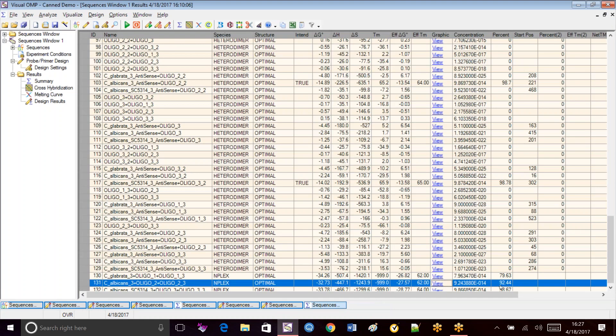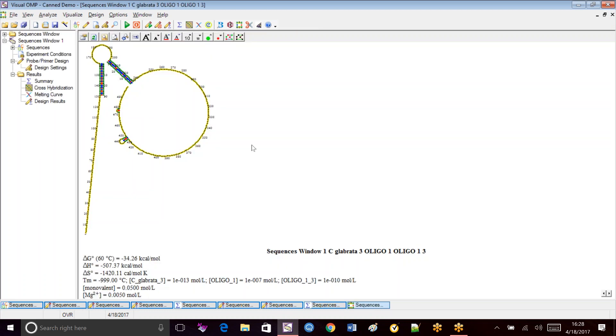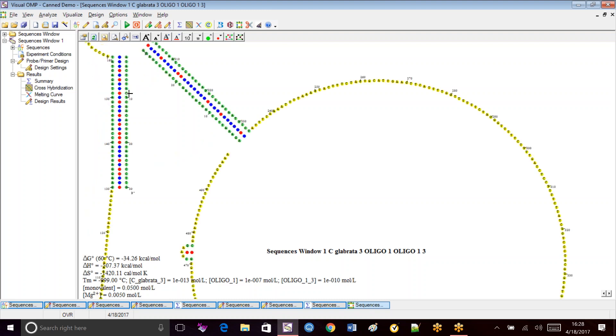Okay, but it's 92.44%. It's not really a bad design. Now we have this one, a little further away, a little downstream from the reverse primer. But we also noticed that it's very AT rich. It's 30 nucleotides. That was the limit that we set for the probe design. But it's very AT rich, we noticed.